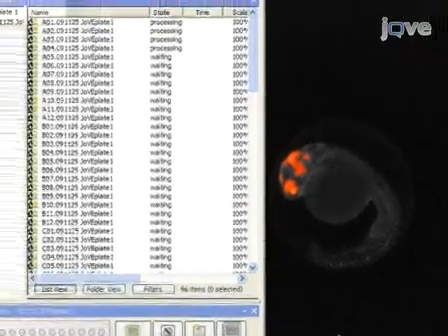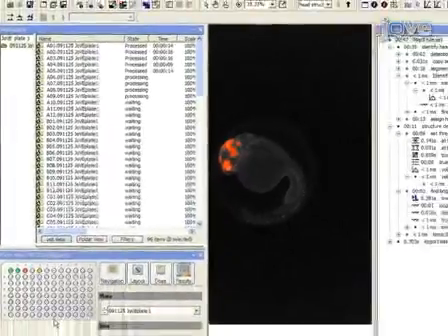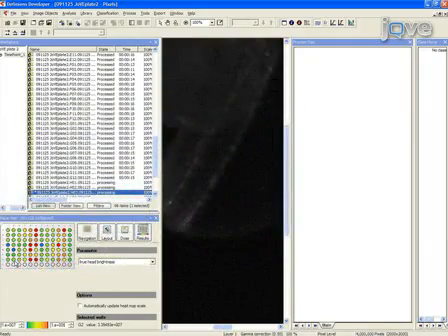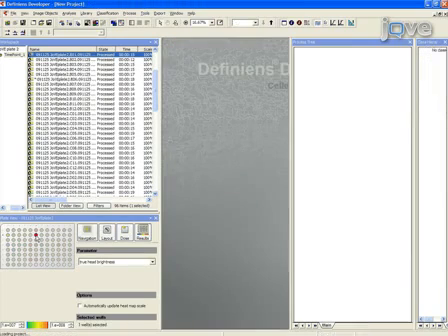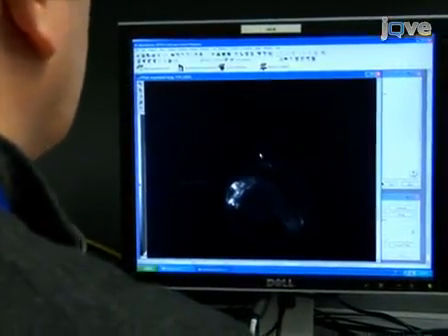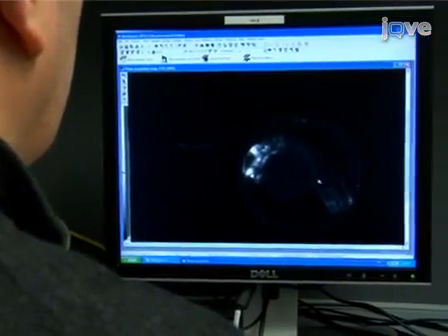Empty wells or ambiguous images will automatically be excluded from the analysis. During the scan, a continuously updating heat map is shown. Both the data and images are accessible during the run for visual inspection. The numerical data and processed images are automatically saved. After all of the images have been analyzed, the data can be exported to third-party software, such as Excel, GraphPad, or Prism.